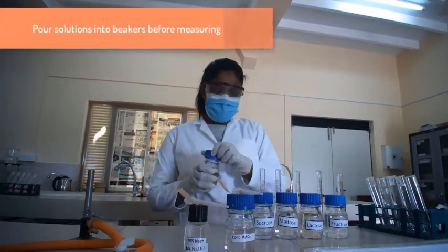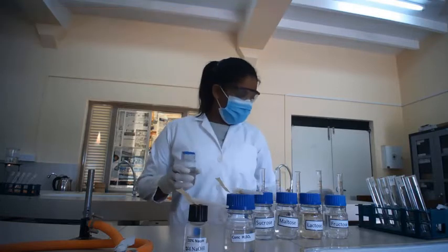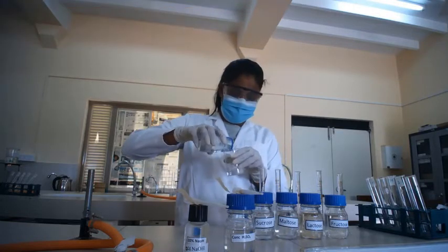So we are going to get solutions from each sugar solution from the beaker.